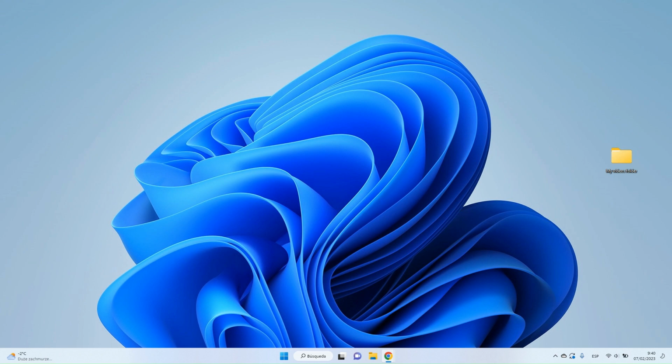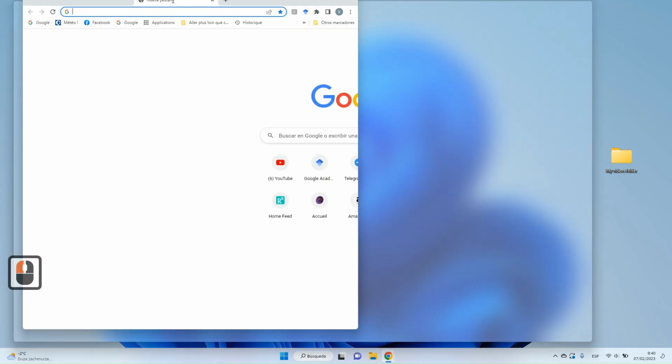In this video we will see how to download and install this free video tracking software. First of all, you have to go to the website. I will put the link in description.